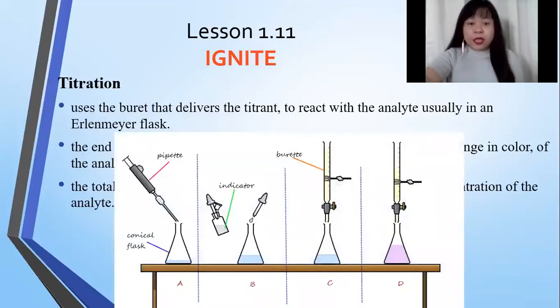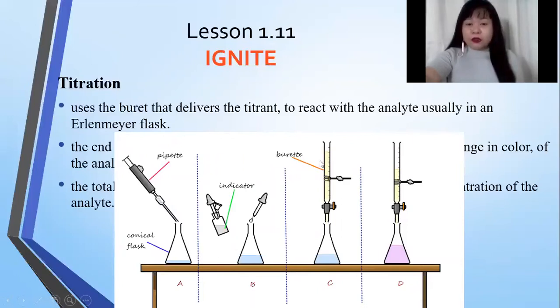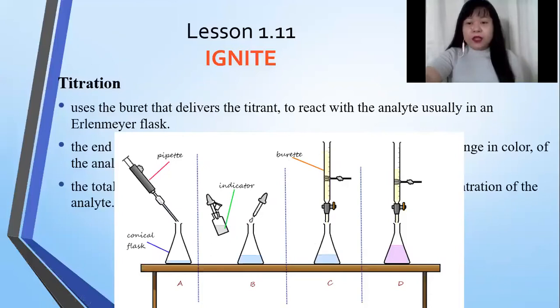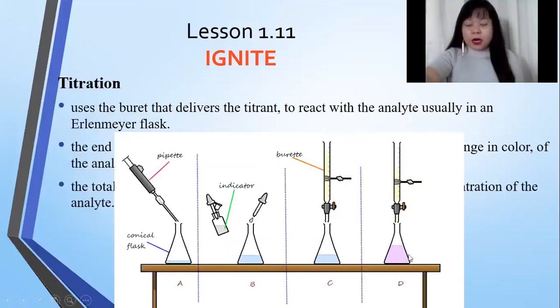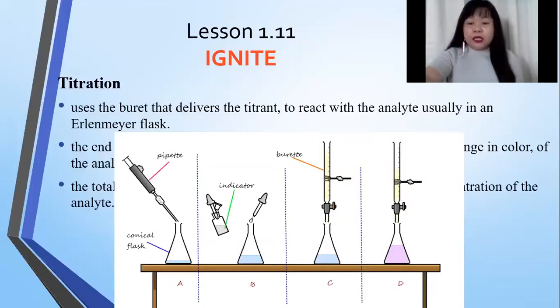We dispense the analyte solution into an Erlenmeyer flask, add a chemical indicator, and measure the initial volume reading from the burette. Dispensing the standard solution onto the analyte eventually leads to a color change — the endpoint — which marks the end of the titration. From a colorless solution, the endpoint is marked by a color change from colorless to pink, indicating an acid-base neutralization titration using phenolphthalein as indicator.